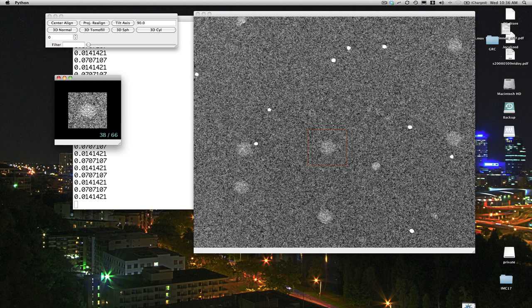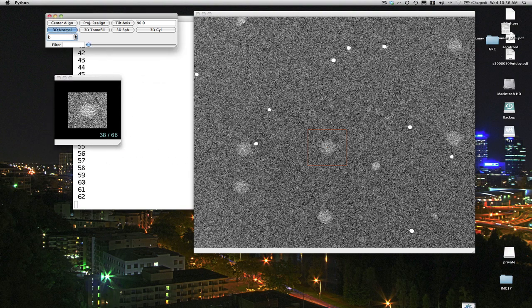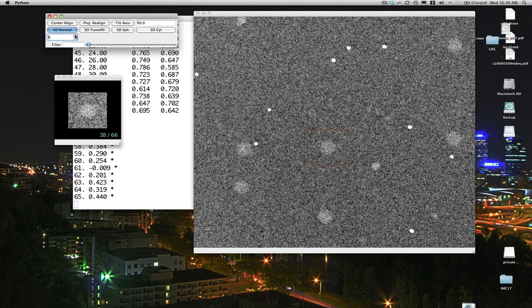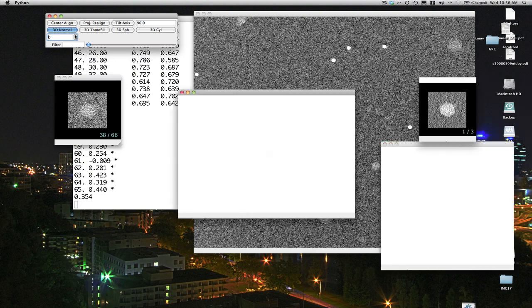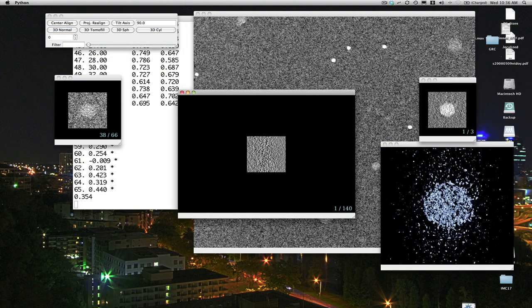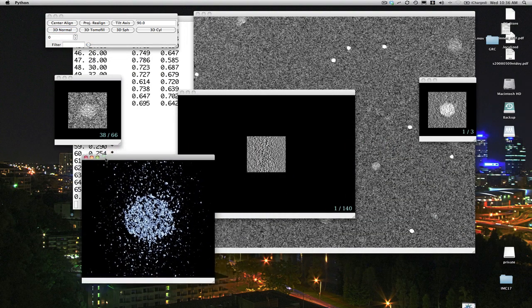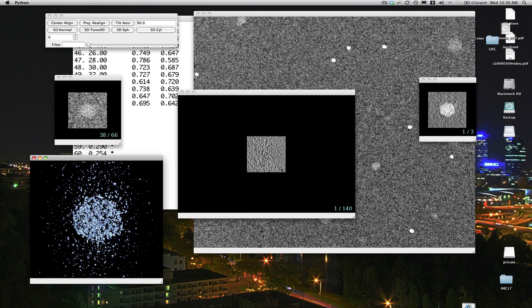So then the next thing we're going to do is we're going to do a 3D reconstruction of that particle. So I'm going to go up to the control panel again and click 3D normal. And that's just going to do a standard EMAN style direct Fourier inversion reconstruction. And you can see we get three new windows appearing after doing this.